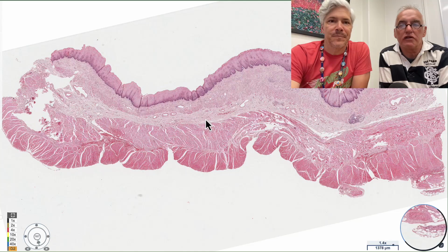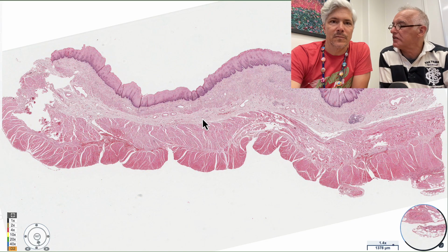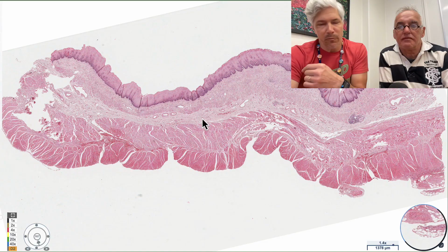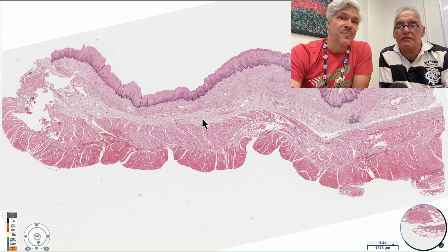Let's start with the esophagus. Sounds good. And you can draw some generalizations using the esophagus that apply throughout most of the GI tract. Okay. Want to talk us through them? Yeah. Well, so first, we've seen the esophagus before. This is actually a different specimen. We'll quickly review the specimen that we saw in Foundations Lab on the epithelium after this one.